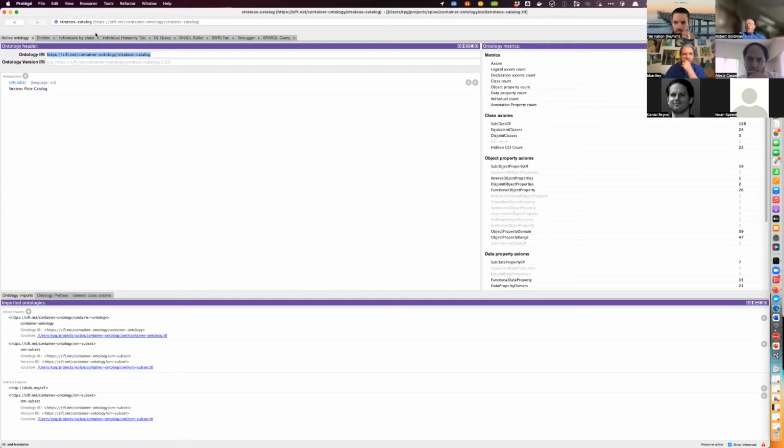And I thought, if we want to get our hands dirty while I'm here to support, I also pulled all the OpenTrons labware descriptions. Now, translating them would be a little different because they're stored in JSON instead of in a spreadsheet.